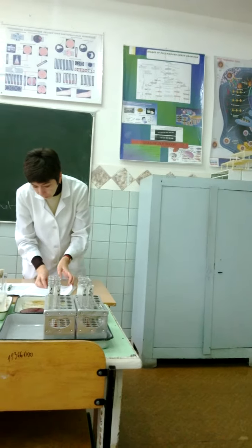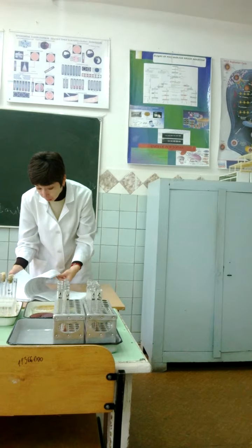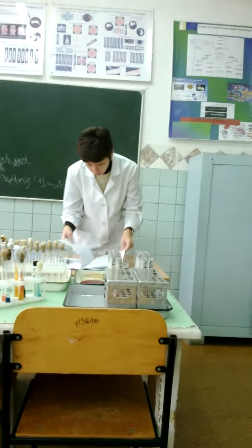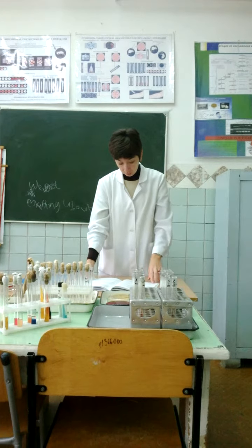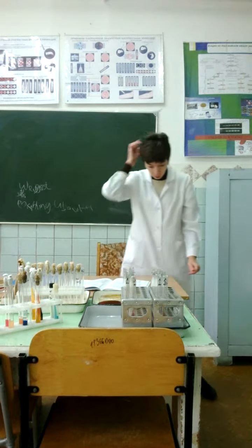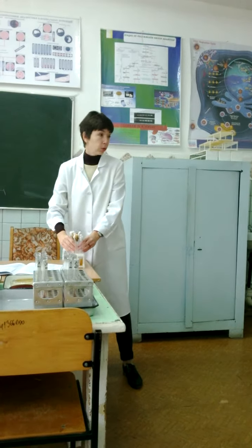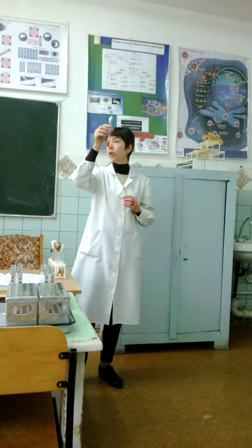The next test is starch fermentation. This test may be used, for example, for Corynebacterium diphtheriae. The biochemical test is positive for Corynebacterium diphtheriae gravis, and negative for Corynebacterium mitis. It differentiates: the test is positive with a pink color because in this media we use starch as indicator, and if it's negative, it remains a yellow color.